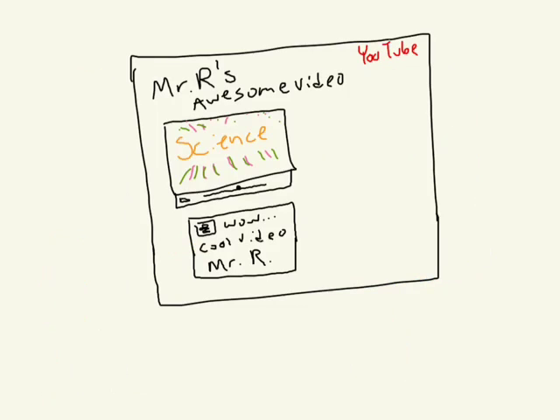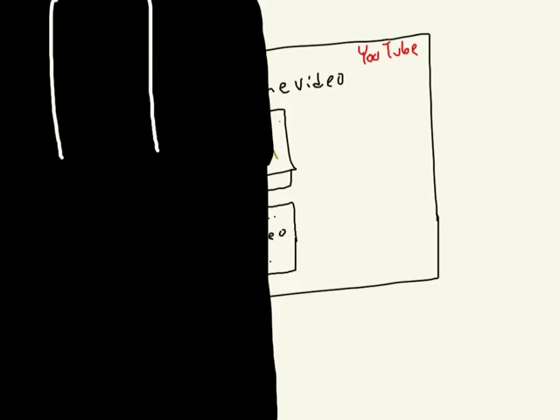Now, field of view is the opposite. As we get closer, the object still doesn't change size, but what we see gets smaller and smaller. Think about your vision. What you are looking at to watch this right now, the YouTube video, that's your full field of view. Your computer or phone or iPad, that is in your field of view. Now, take your left hand, put it over your left eye. Your field of view just decreased by roughly half, but the size of what you were looking at did not change. Now that may not be the best example, but I'll explain it more clearly shortly.